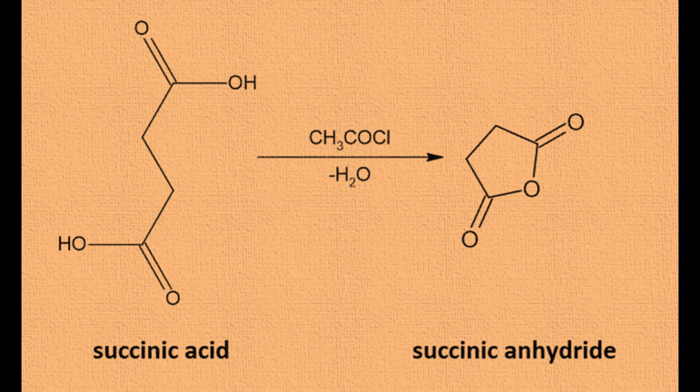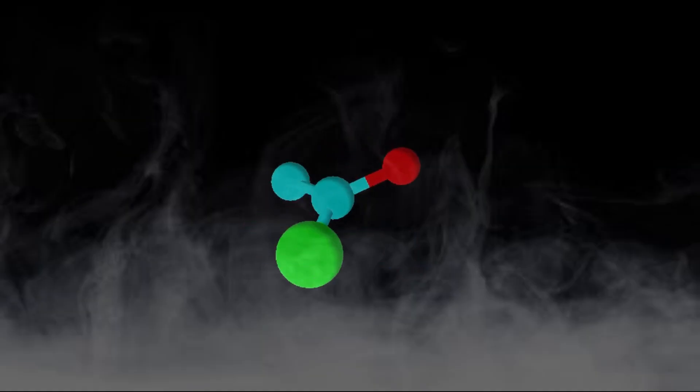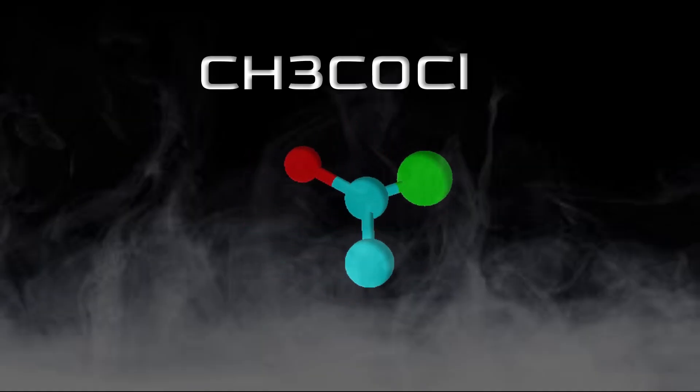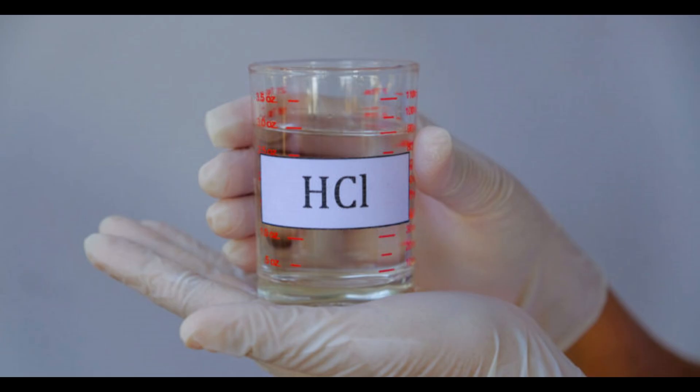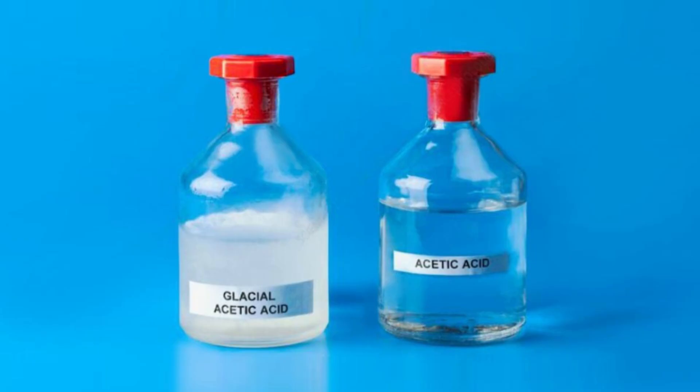In the second process, we will eliminate the water molecules with acetyl chloride, which is a more expensive and dangerous reagent. Acetyl chloride vapors are dangerous. When they come into contact with humidity, they transform into a mixture of gaseous hydrochloric acid and acetic acid, which is very irritating to our lungs.